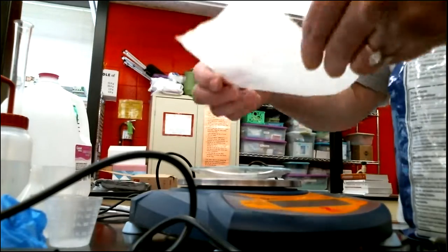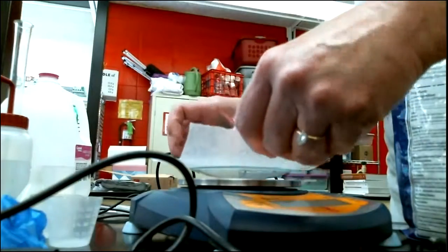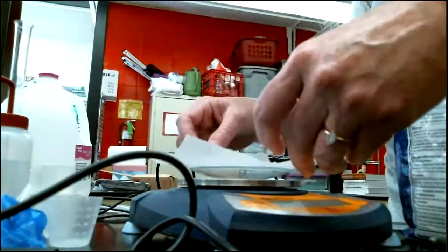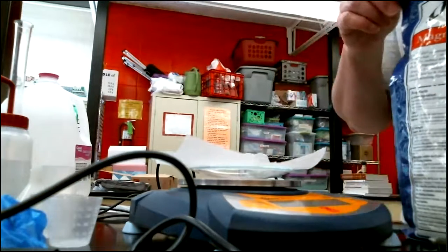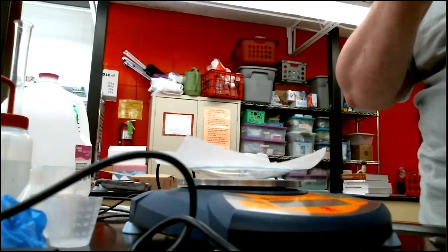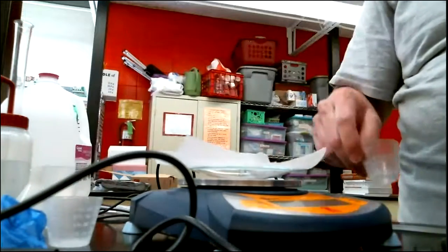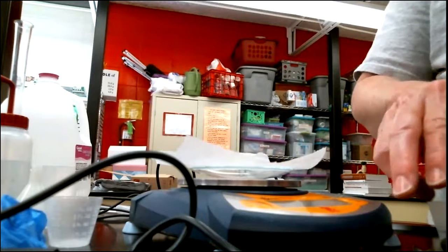So also I've got a piece of wax paper that I use for weigh paper. I'm going to put it in there, and it's going to help me be able to transfer my salt into the volumetric flask without spilling it. So that's a key consideration. When you're making a solution, you do not want to spill a bunch of it, because if you do, that messes up your whole calculation. It messes up your strength.